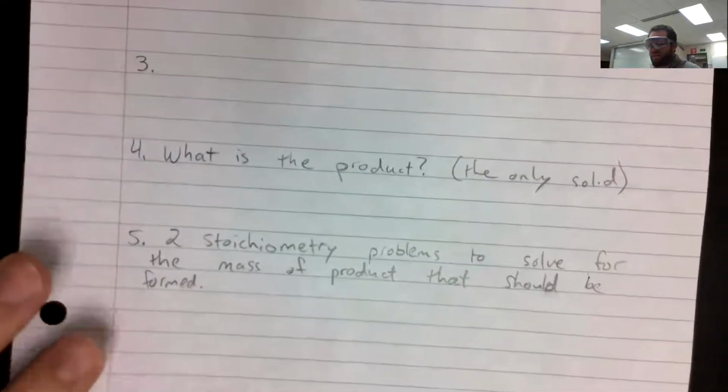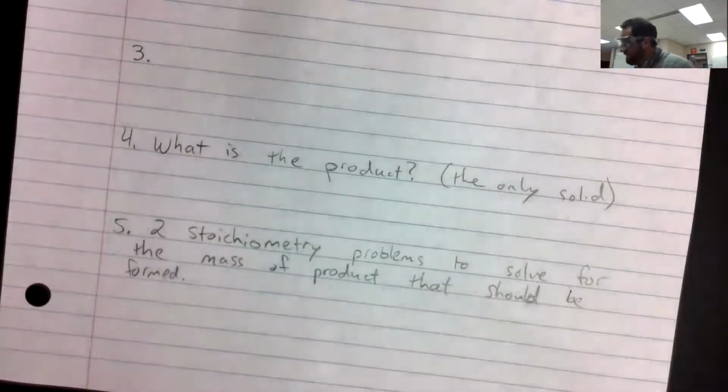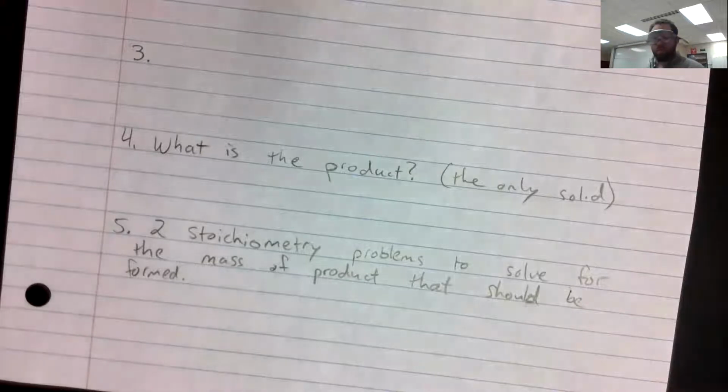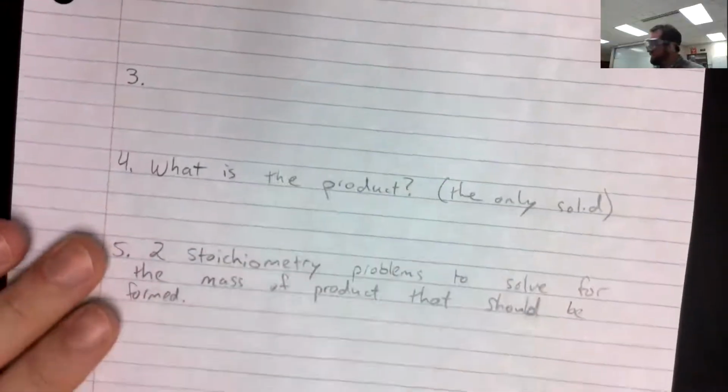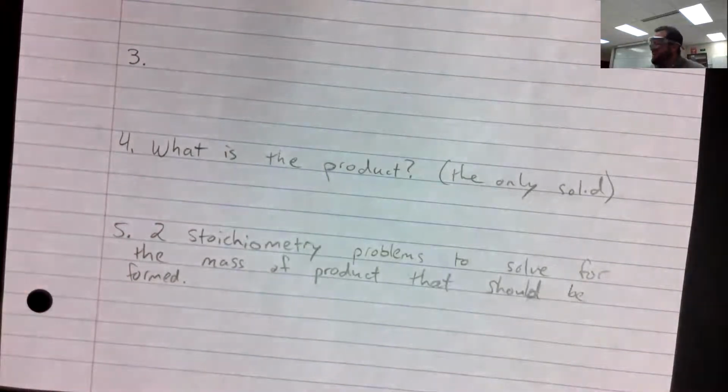And that's going to take you guys a few minutes. You definitely need your periodic tables. Find your molar masses of the 2 substances you guys worked with. Almost certainly have to go to the back side of the table too, or that back side of this paper too. Keep this over and keep working. And I'm just still watching our solution go. Fun times here.